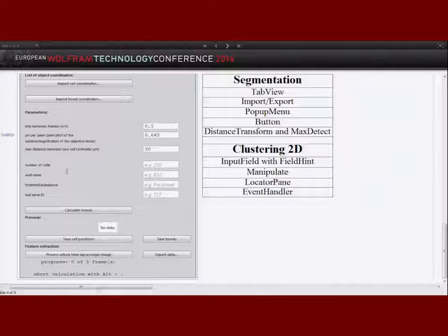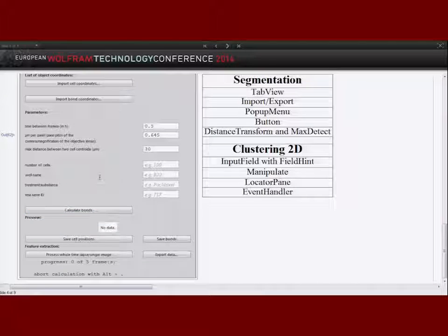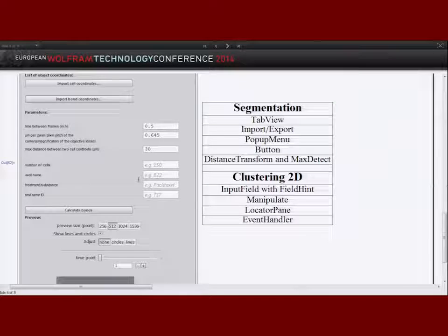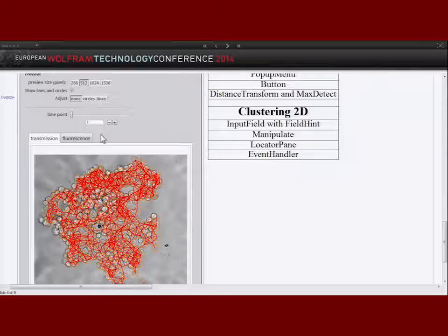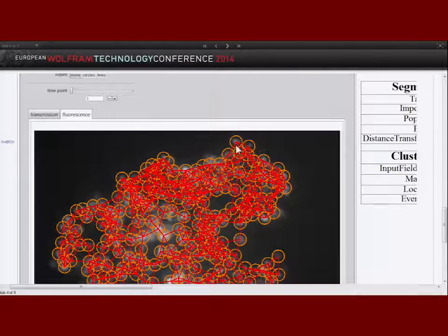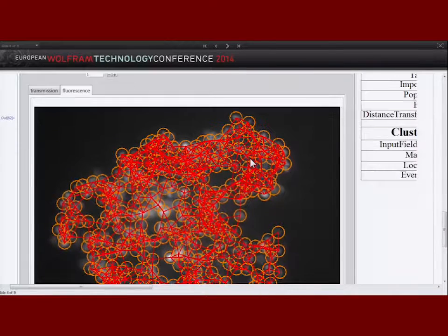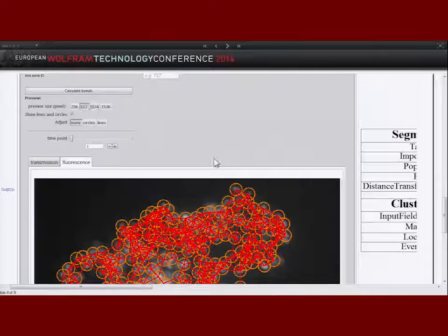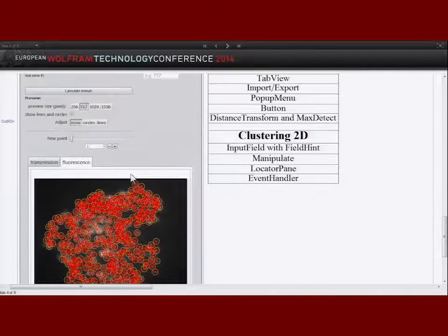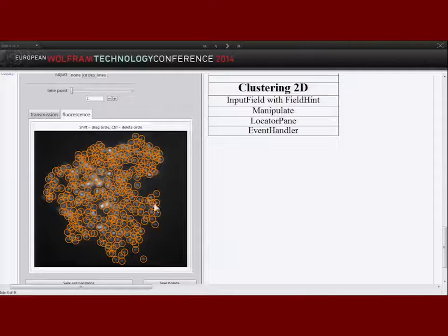In the middle part we can also specify parameters, for example a maximum distance between two cells, which is important for bond calculation. Assuming a bond between two cells gives more information about associated cells and cell clusters. When we click 'calculate bonds' we get a visualization where orange circles are overlaid on top of the detected cell nuclei and red lines indicate the bonds — the connections between two cells within a certain distance.